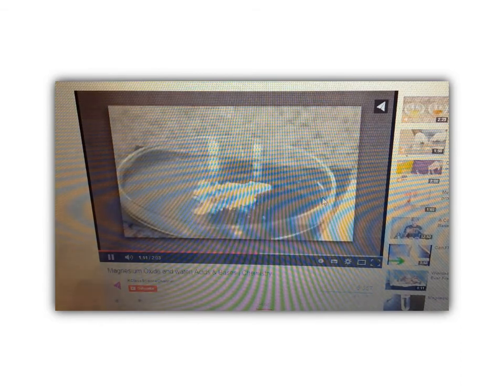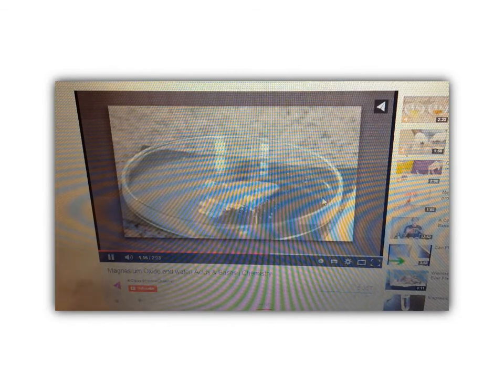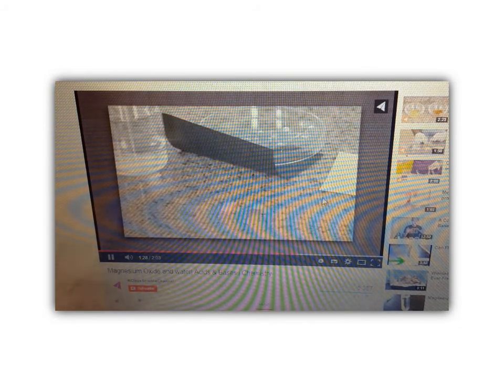If I add some water to that magnesium oxide, I'm going to create a solution where magnesium oxide has reacted with water. The litmus paper, the red litmus paper turns blue. The blue litmus remains the same color, and this shows that you have formed an alkaline solution.